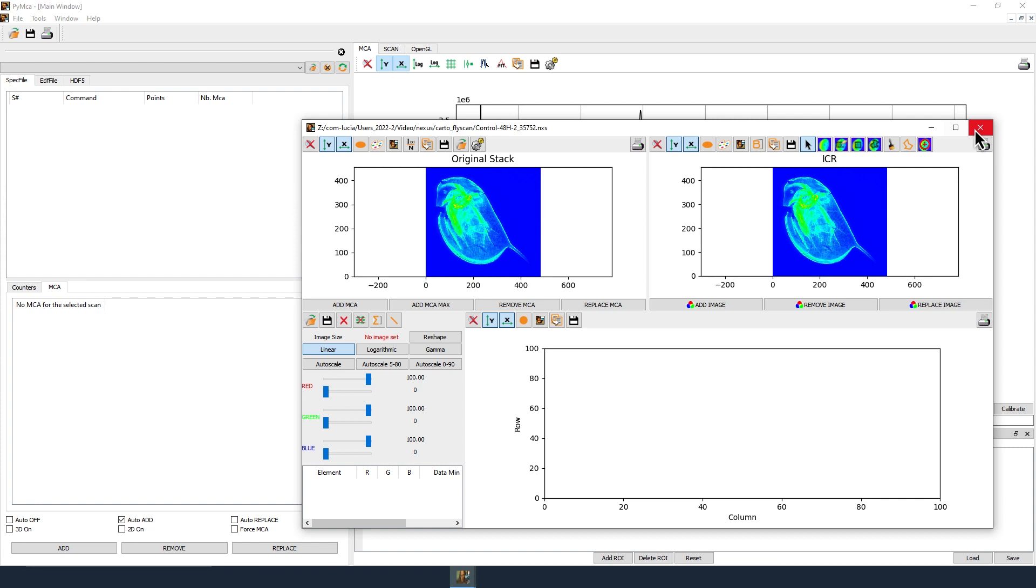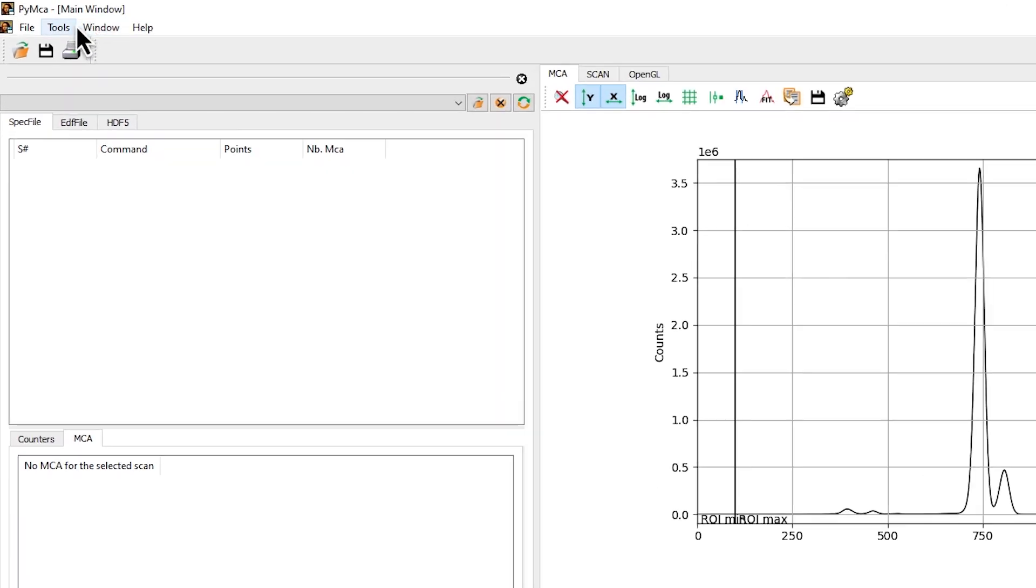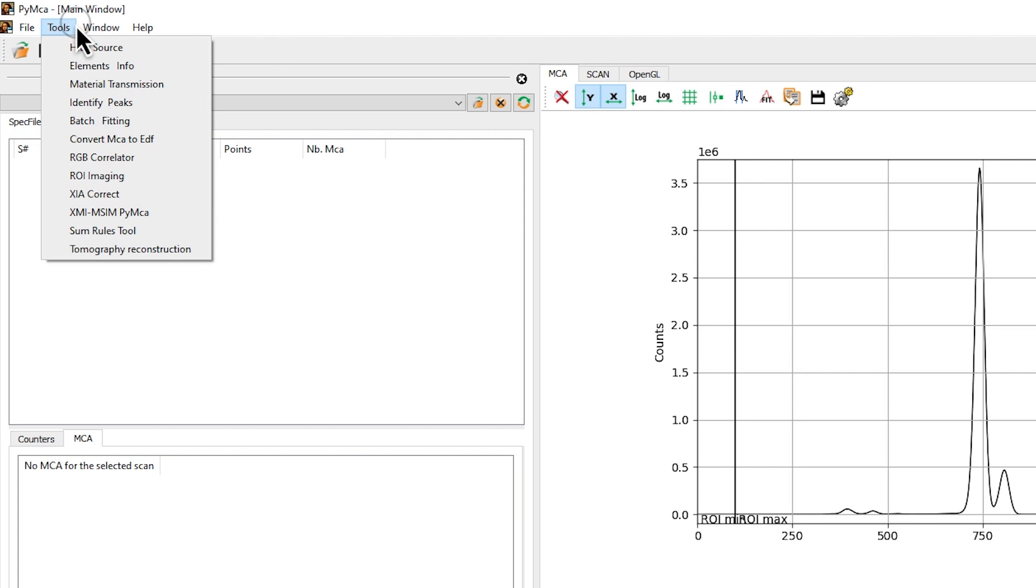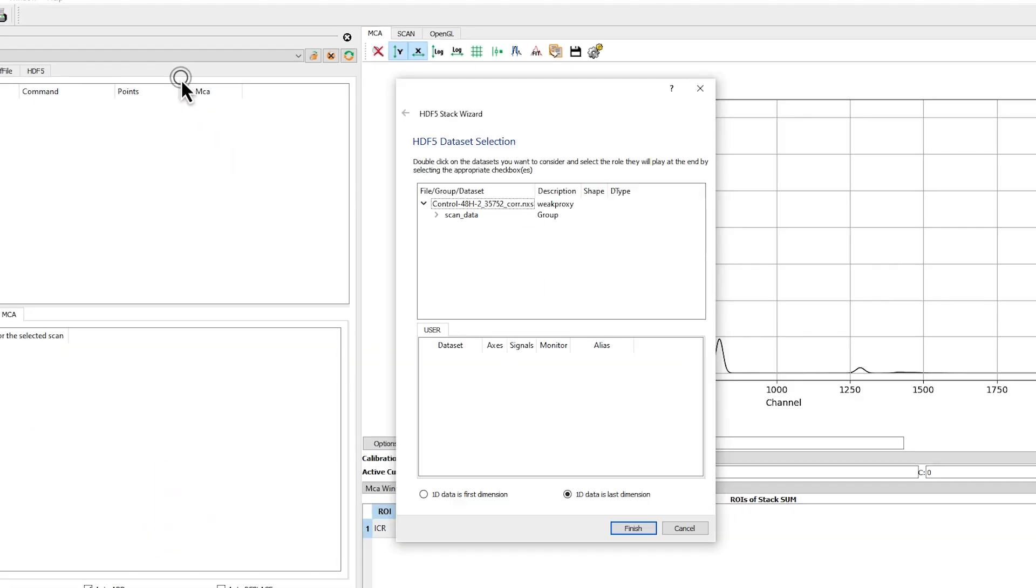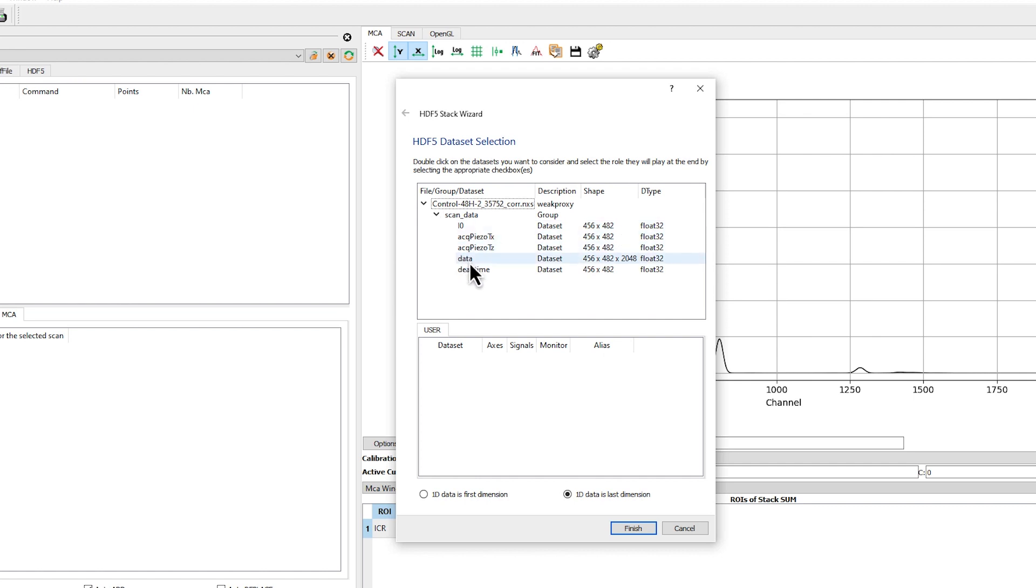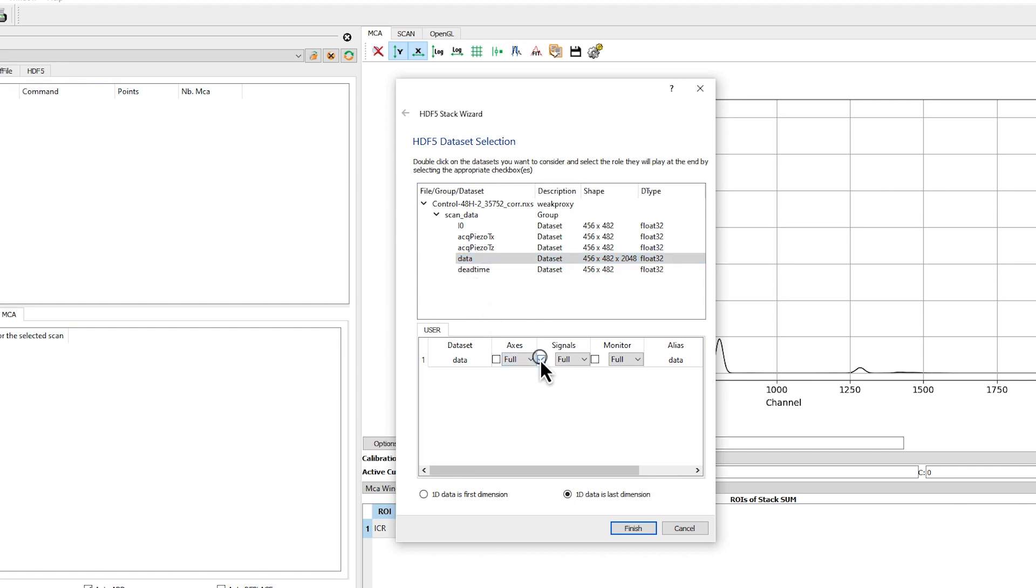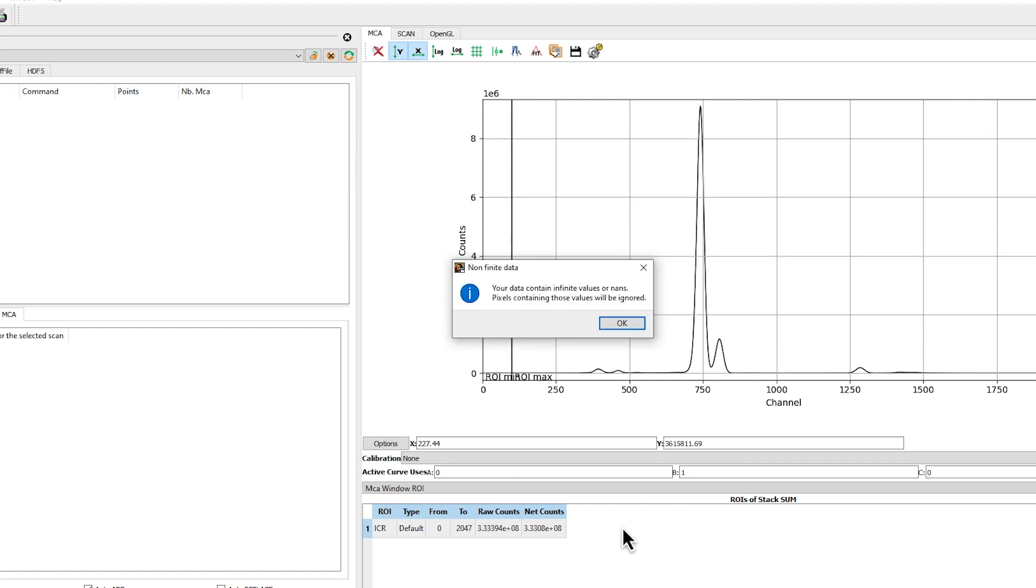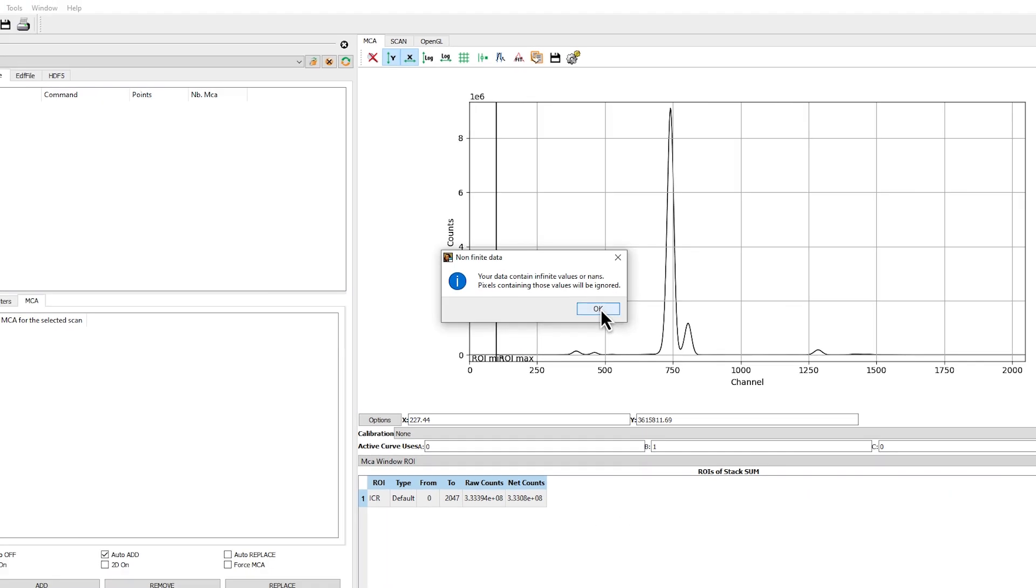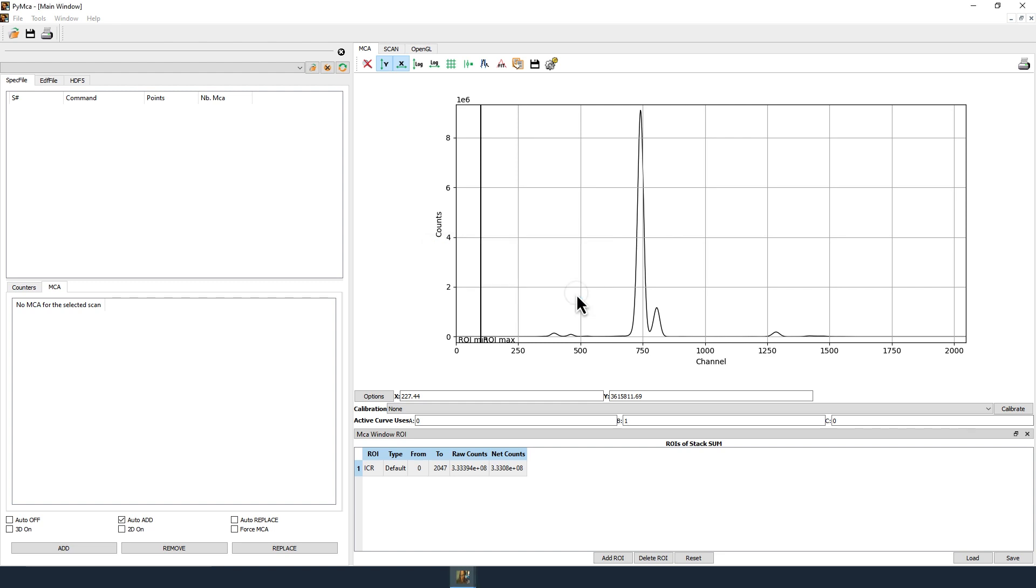If you want to open an incident flux and detector dead time corrected file, click on Tools, then ROI Imaging, and select the file with the underscore corr extension. In the HDF5 stack wizard window in the user tab, expand the file architecture and double click on data to select the corrected fluorescence data. Check the signals box and click Finish. If present, accept the message indicating the presence of infinite values or not applicable.